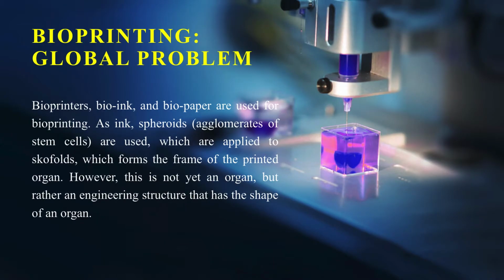Our research is related to the bioprinting industry, and bioprinting in its essence is a task of composing cells in a particular order and ensuring their proper growth so they can form a biological tissue or an organ. For this purpose, cells are immersed in special materials like gels, and the combination of cells and such medium is called bioink.